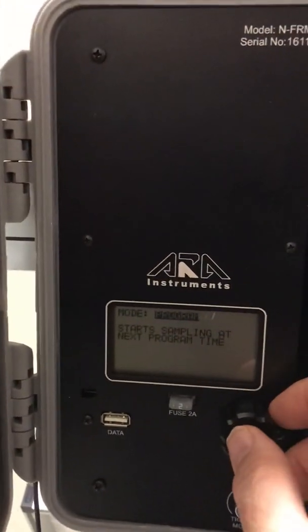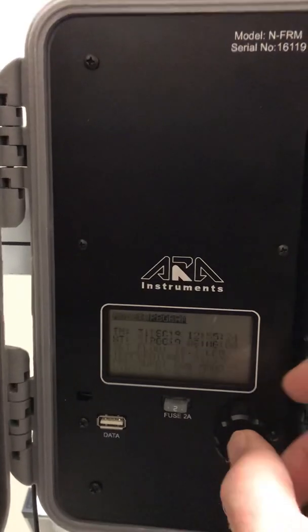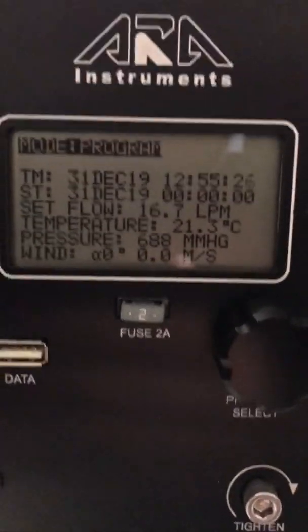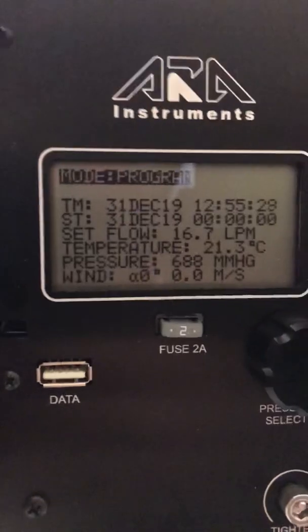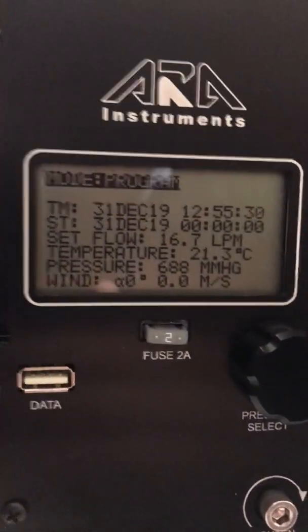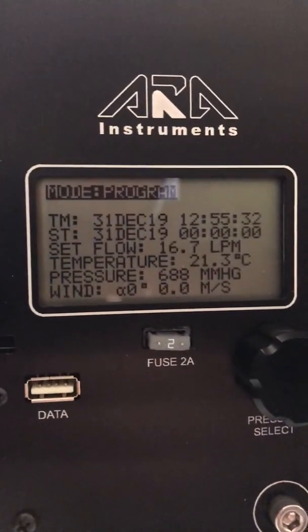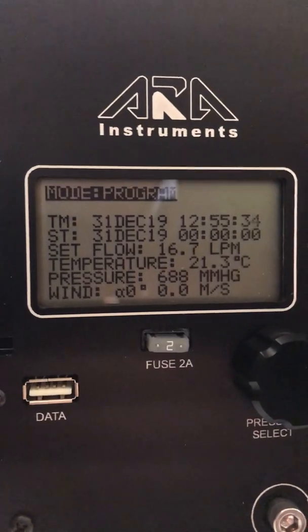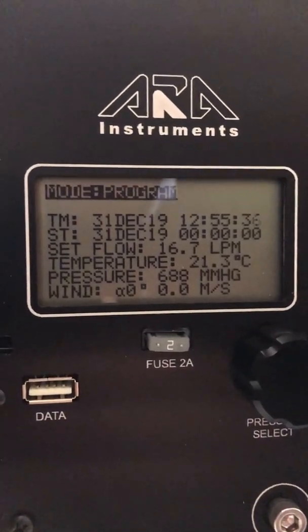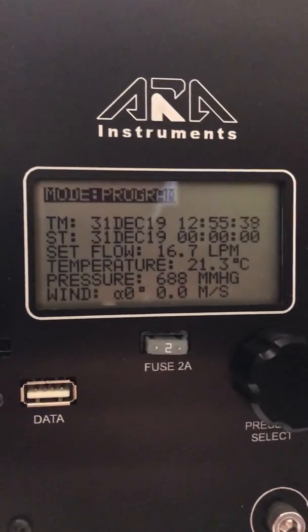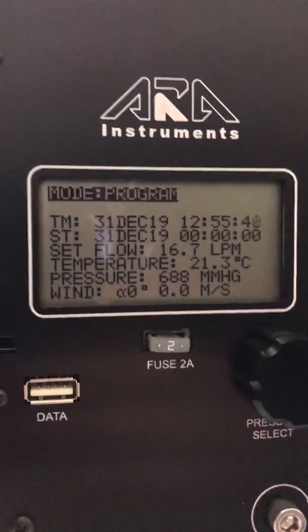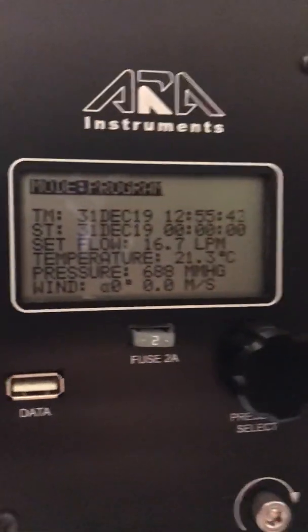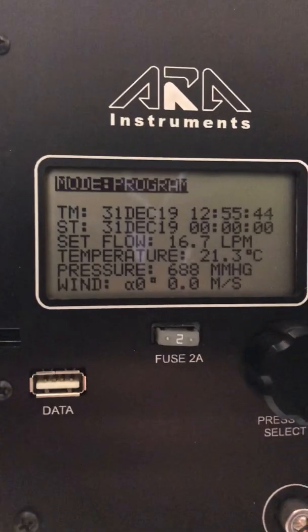You can see the menu right here. It's much like the midnight to midnight sampling we've done in the past. It has a program set where you can set for midnight to midnight or midnight till noon. Select your time, and the pump will turn on at the required time, sample through that period, and then shut off.